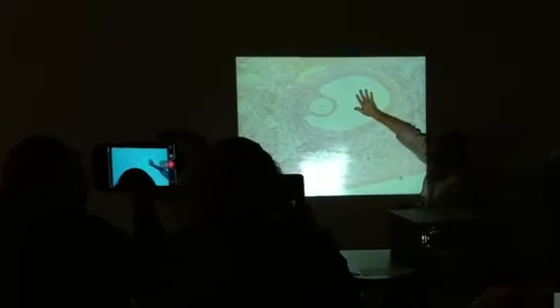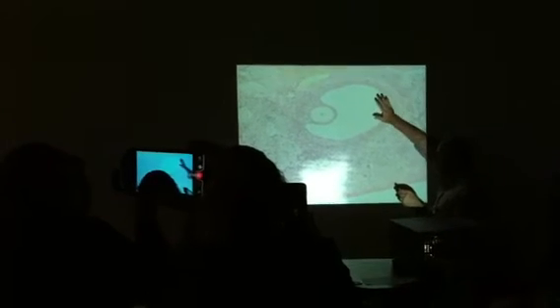Now, what do I usually ask on this thing? I usually ask that, which is the antrum. I usually ask that right there, which is the corona radiata. And many times I ask, what is this entire thing? It's called a Graafian follicle. What does Graafian mean? Graafian means it's ripe, so to speak. It's ready to ovulate. That is the Graafian follicle right there.